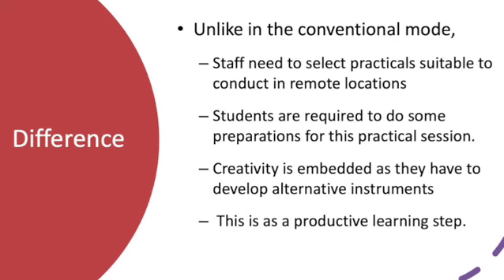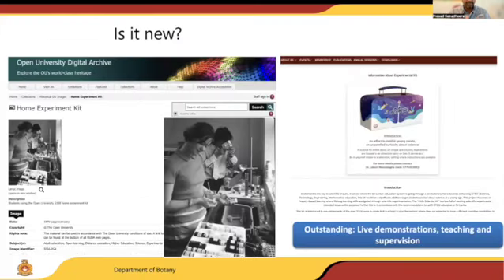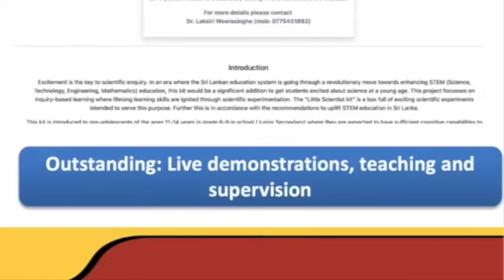Though we say that OARP is a new method, OUUK has something similar, and this is a screenshot from the website of the Sri Lanka Association for Advancement of Science, where they made available some kits. However, there is an outstanding feature in what I am presenting, because this contains live demonstrations, teaching and supervision, and the engagement of the students in these experiments.